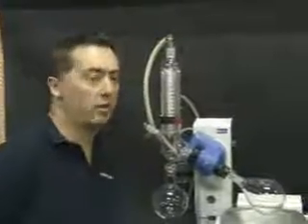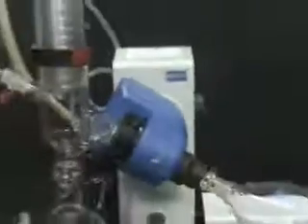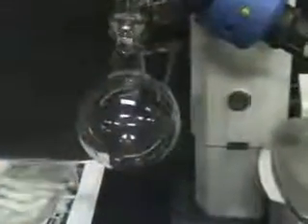Hi, this is Michael Natal from Hi-Tech Trader. This is the IKA RV-10 Evaporator, with 1,000 ml flasks receiving and evaporating.